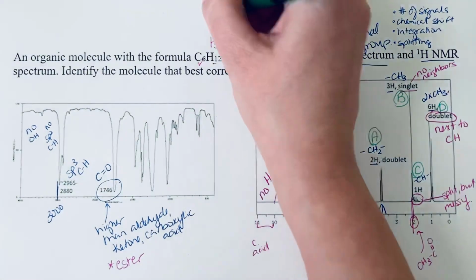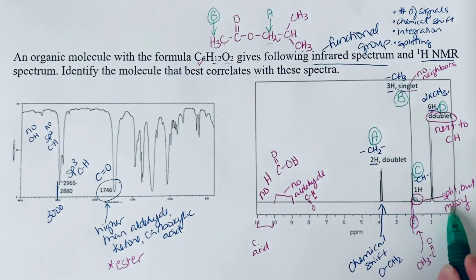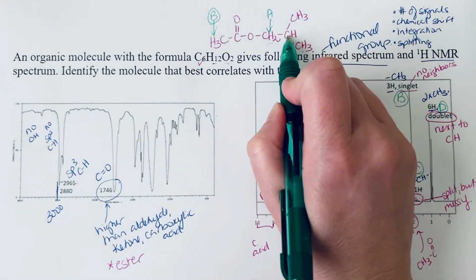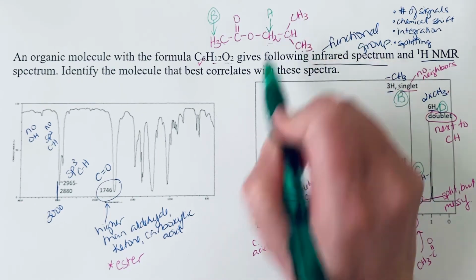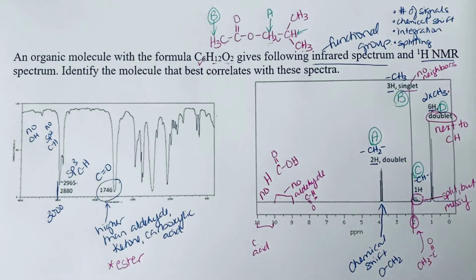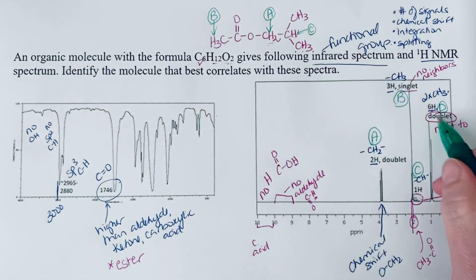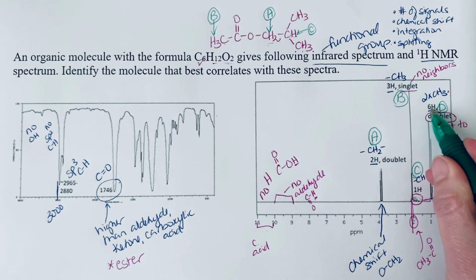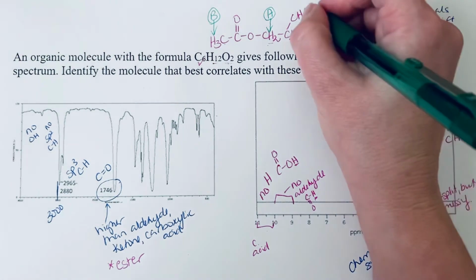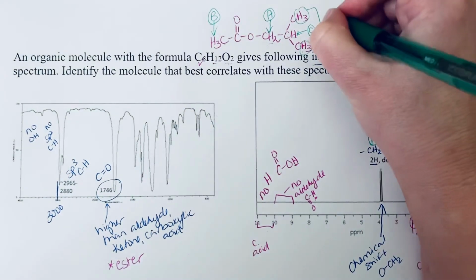So these are B. The signal C is that CH with a whole bunch of neighbors. As a matter of fact, it's got 8 neighbors, so we would expect that splitting to be fairly messy like that. So C is those signals. And then finally, this 2 CH3 groups for that 6 hydrogen doublet are these. So we'll say those ones are D.